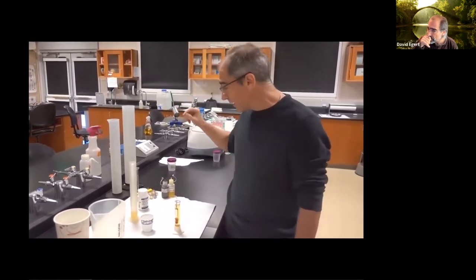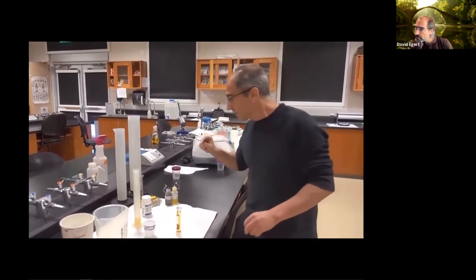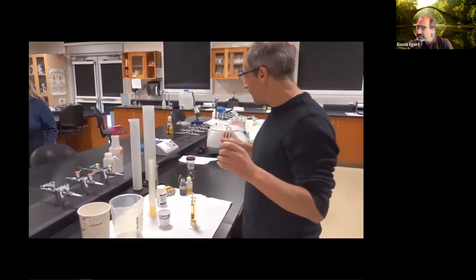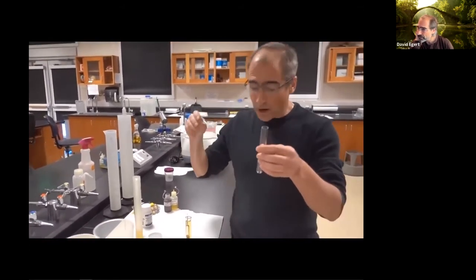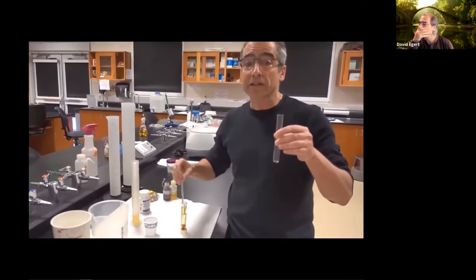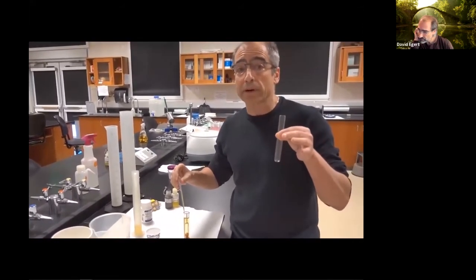For that, I am going to need a little test tube and a dropper right here. And so basically I'm gonna need 10 drops of my urine. And it matters that the drops are actual, well calibrated drops.